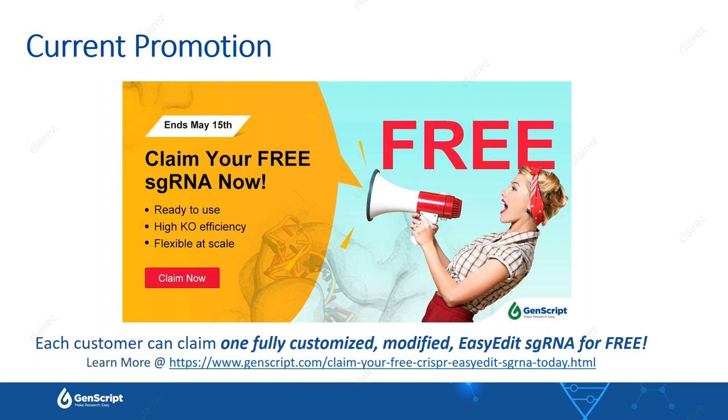That is a good question. I'm not sure about that. I think you would have to purchase the CPF1 protein and then order the guide RNA that's suitable for the CPF1, because I think the scaffold design, the lens and everything in terms of sgRNA for Cas9 and CPF1 is very different. So yes, you can still deliver CPF1 protein and the guide RNA in a ribonucleoprotein format. It's just using different reagents and design essentially.